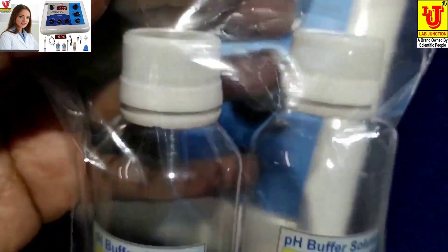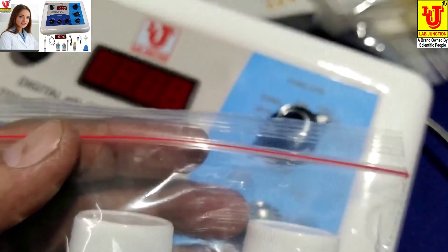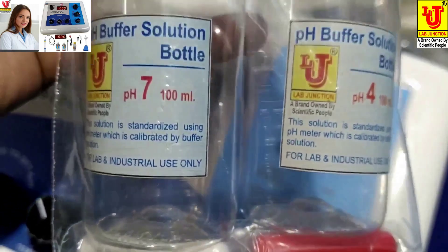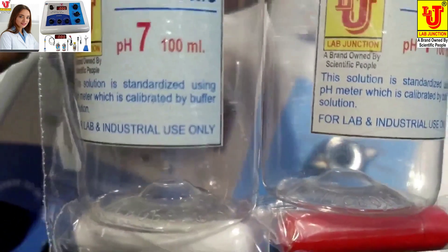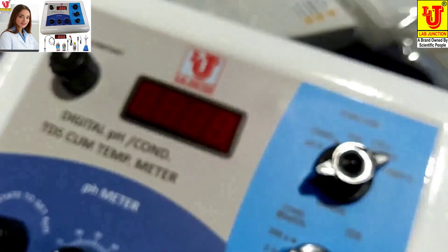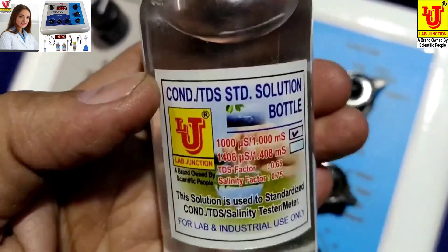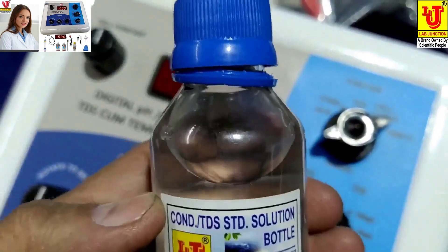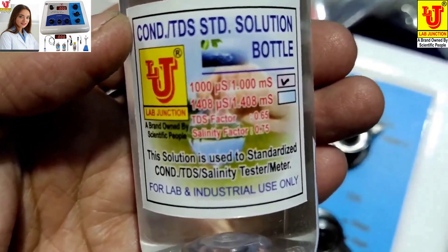pH buffer bottles with capsules — 7 pH and 4 pH. You have to add 100 ml distilled or de-ionized water to each bottle, add the powder from the capsule, and wait for 4 hours only. After that, your buffer solutions are ready to use. This is conductivity/TDS standard solution for standardizing the instrument — it has 1 millisiemens for conductivity, 650 for TDS, and 750 for salinity.